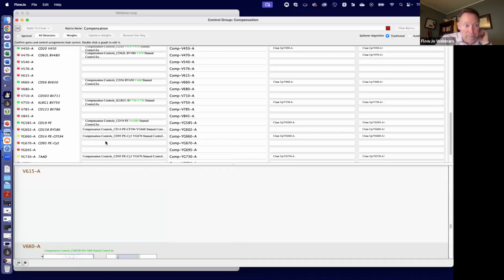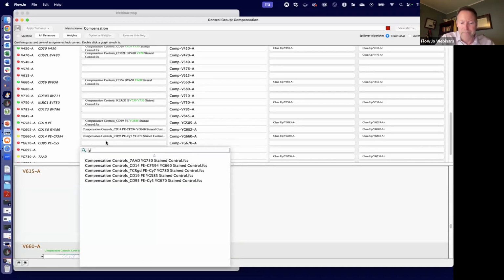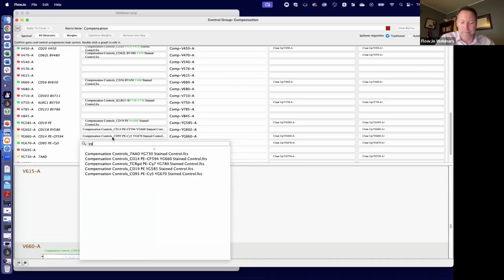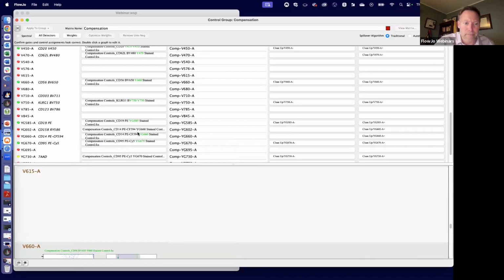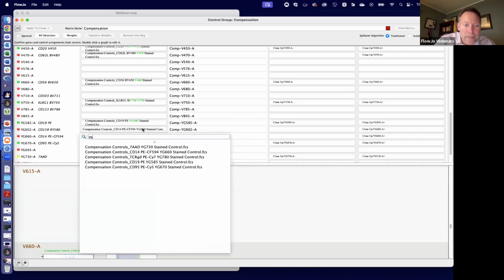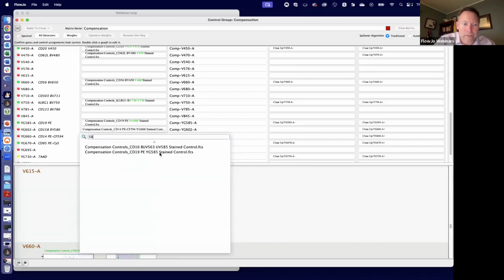YG670 is right there. Oops, except I want a YG670 here. And I want a YG660 here. And the 602 or 585. 585 there.